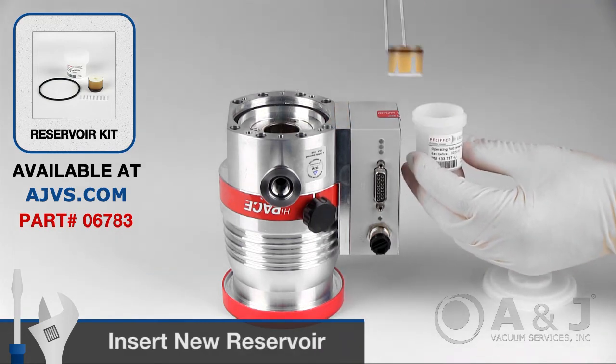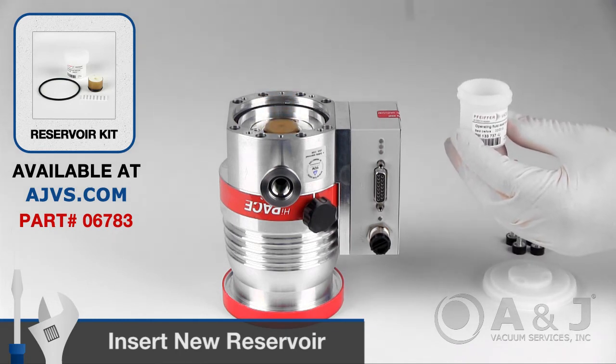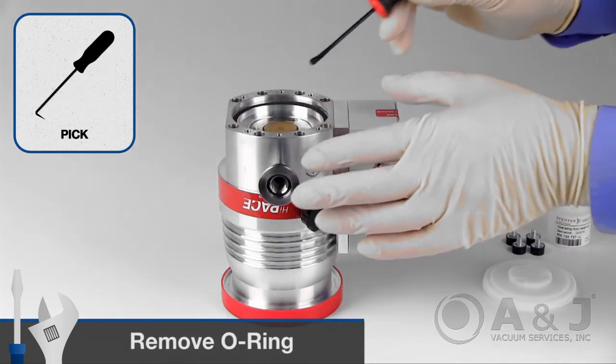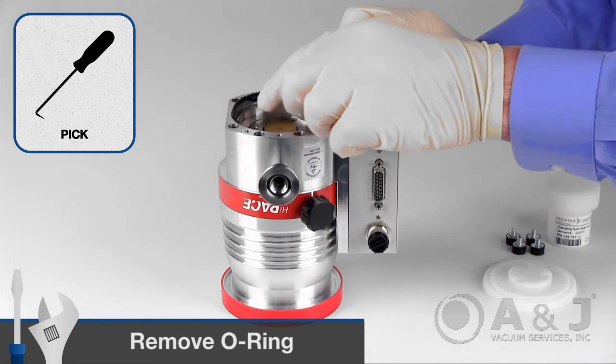Insert the new operating fluid reservoir into the turbopump by pushing it up to the o-ring. Remove the old o-ring and replace with the new o-ring from the reservoir kit.